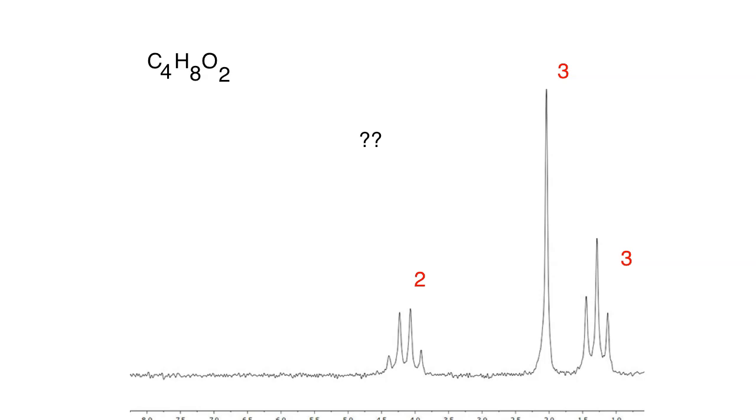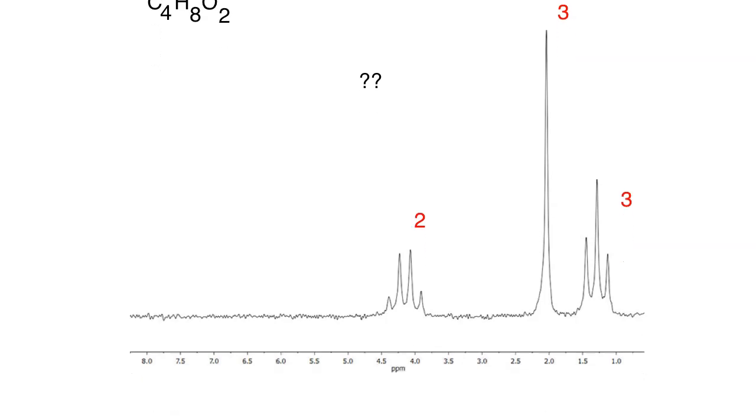All right, so let's take a look at this. We've got C4H8O2, and if we take a look at the structure here, I see an integration of 3, 3, 2, and I see a triplet, a singlet, and a quartet. Right? Now, in terms of the approximate location, this might be a little small, so I'm going to write it out here. The chemical shift for this peak is about 1.2 for the triplet. All right, it's about 2.1 for the singlet, and then for the quartet, you're looking at about 4.2.